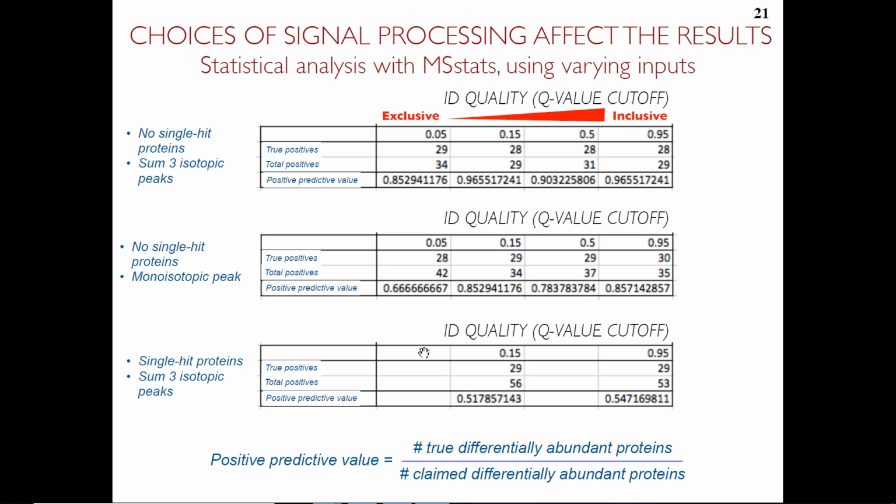So all of that are tuning parameters. When I was saying earlier in the hour that you have to have these parameters, you cannot not have them, but we also don't want our results to depend entirely on that. And so using this type of controlled mixtures is one way to see what is reasonable and to have some guidelines. And then within these guidelines, you would hope that qualitatively the results will be very similar.